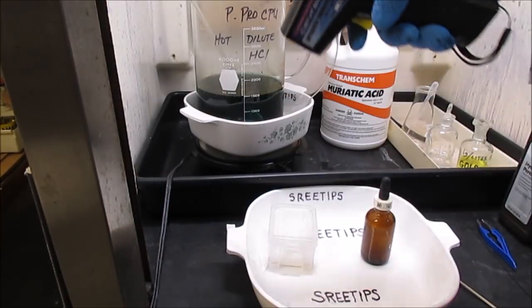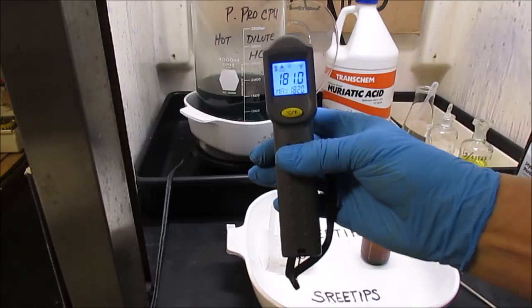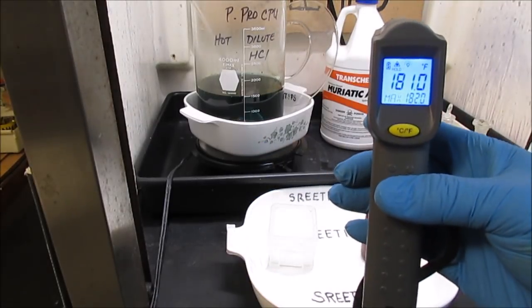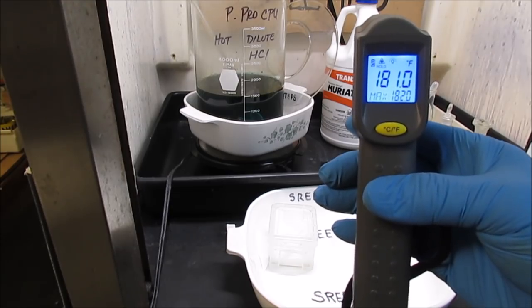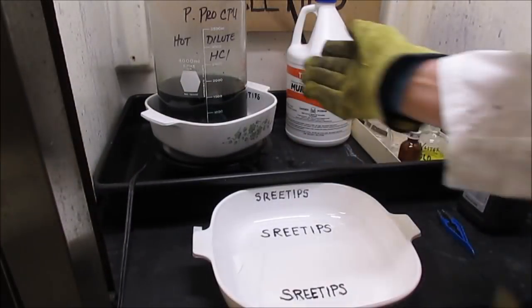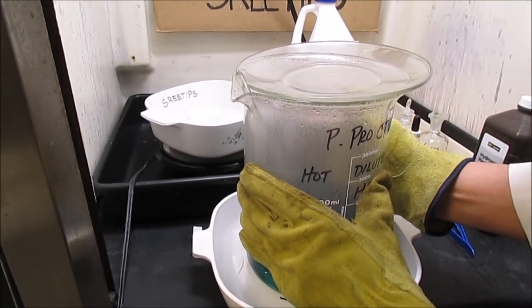Before I turn it off, I want to go ahead and get a quick temperature reading for those that are interested in what that's going to be. And we've got the temperature inside the beaker there at 181 degrees Fahrenheit. Pull the beaker off the heat. Let it cool down so we can filter it.